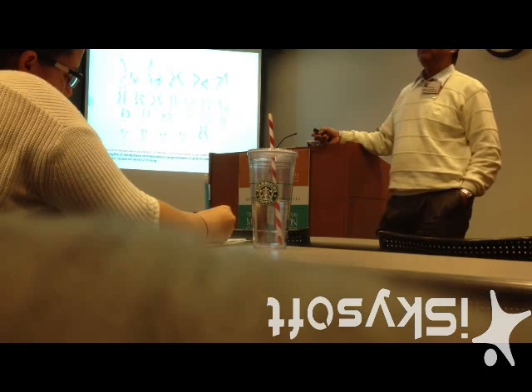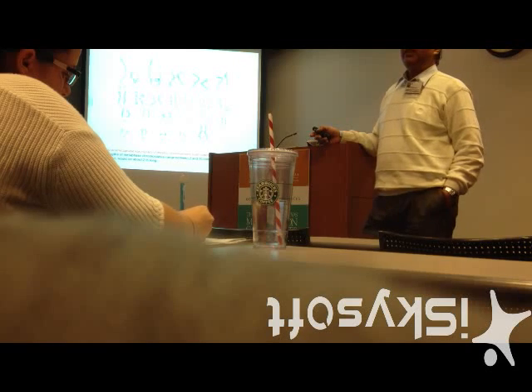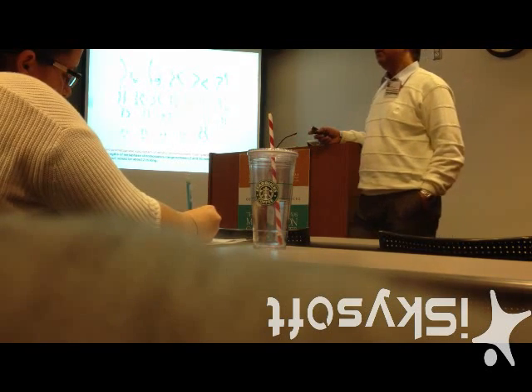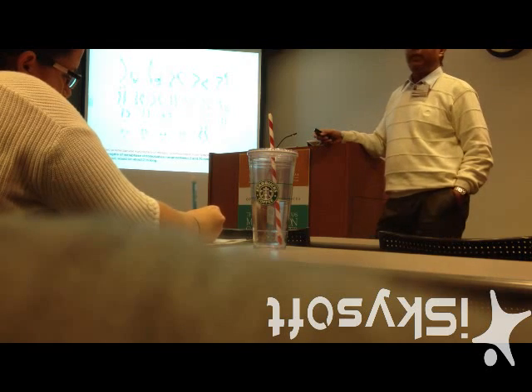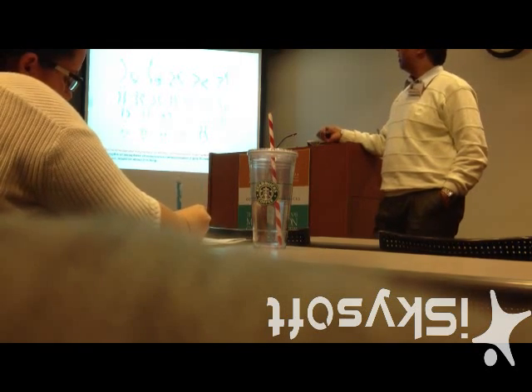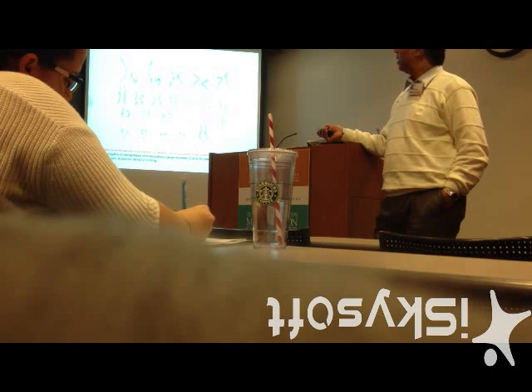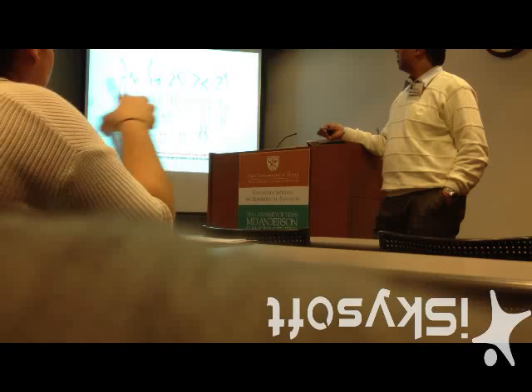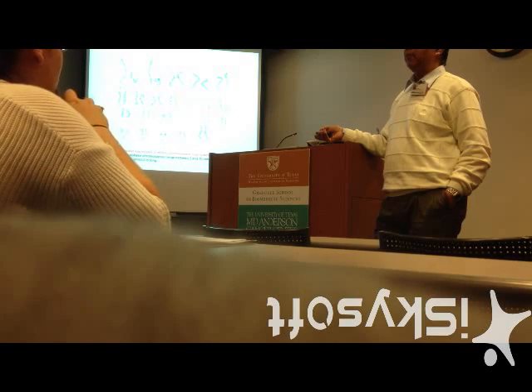Similarly, there are a number of chromosomal translocations identified in different cancers, most commonly known in hematopoietic malignancies, leukemias, and lymphomas, which involve chromosomal translocations. Those translocations can be identified by staining the chromosomes with this kind of technique.